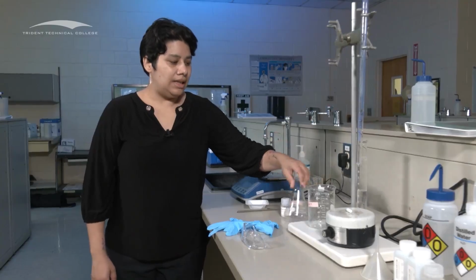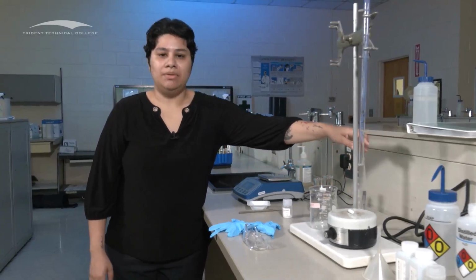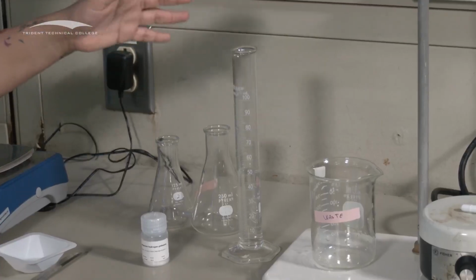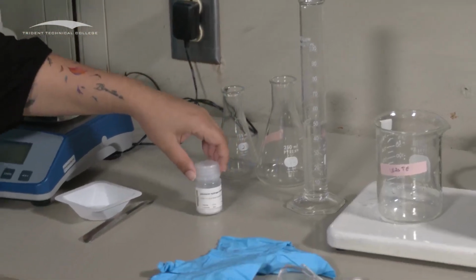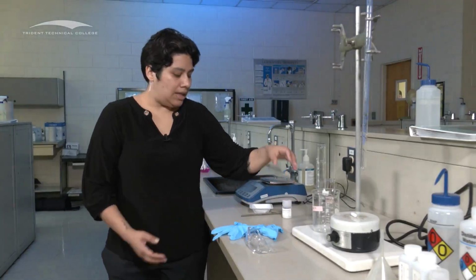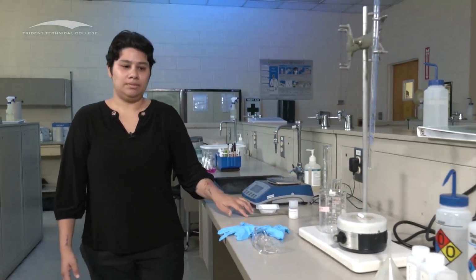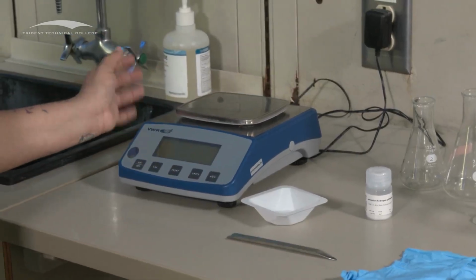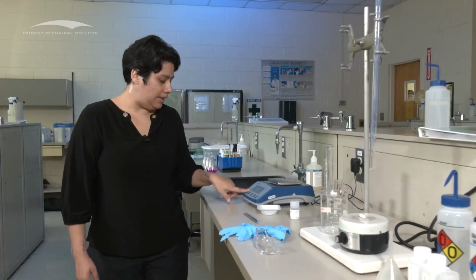And then you're gonna need a graduated cylinder. Mine's already pre-filled with water, but you don't have to pre-fill it with water yet, so I'm just showing you. And then you're gonna need your KHP, which is your potassium hydrogen phthalate. Then you're gonna need a weigh boat, spatula, and then of course, your electronic scale. So let's go ahead and get ready.